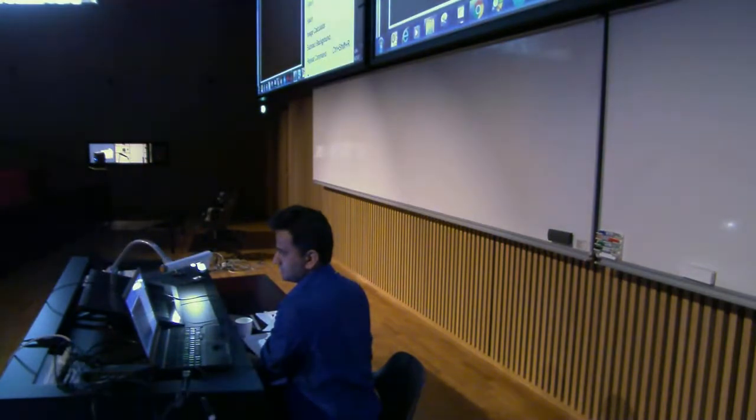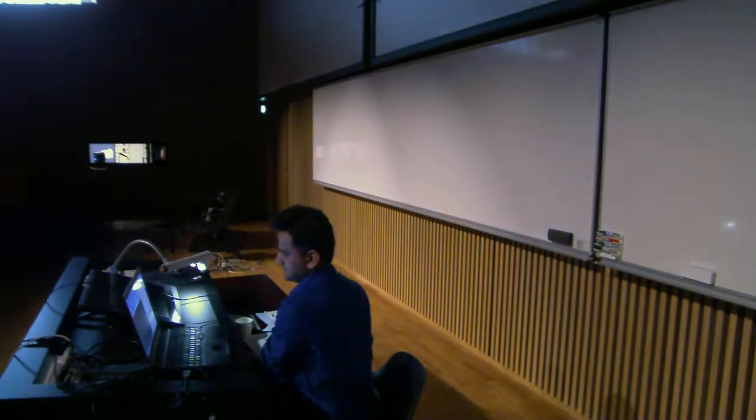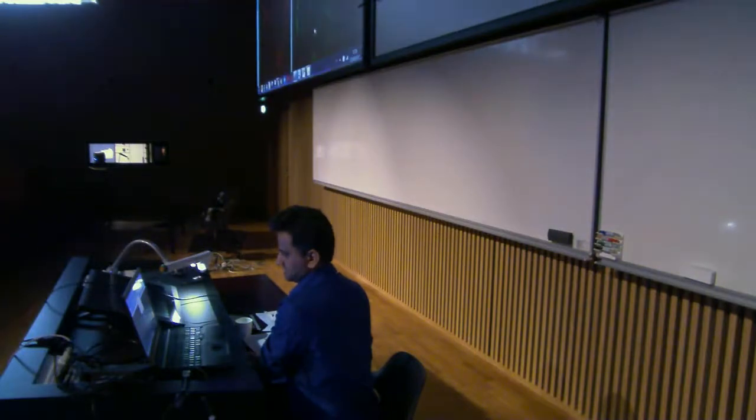If you just go process. Yeah, there is one pixel over here. Oh, that's gone. Process, image calculator, create, maybe add actually.